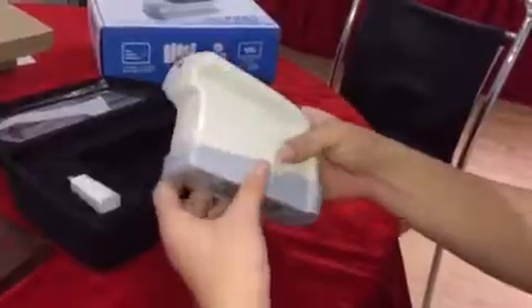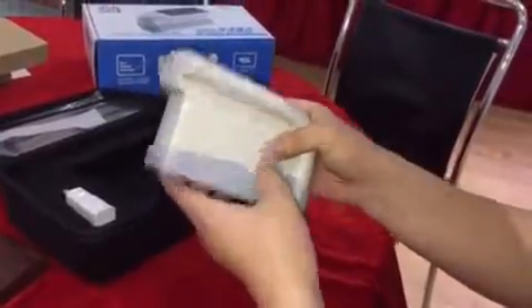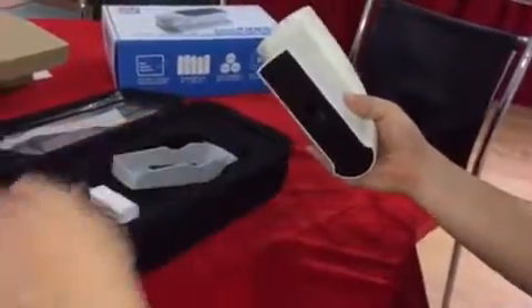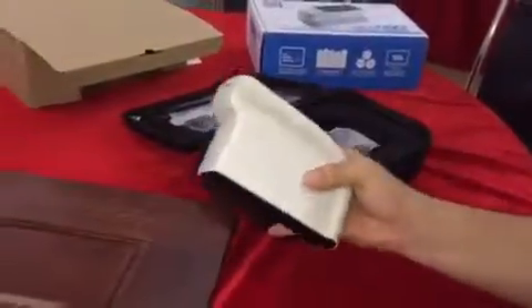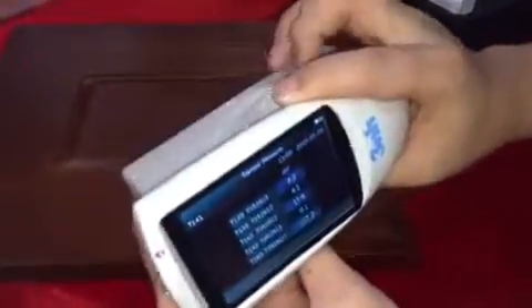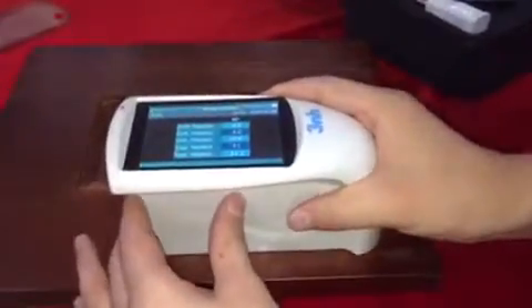Let's start measuring the sample. Take off the calibration board and put the glassmeter on. Put the aperture on the sample, then press the testing button to test.